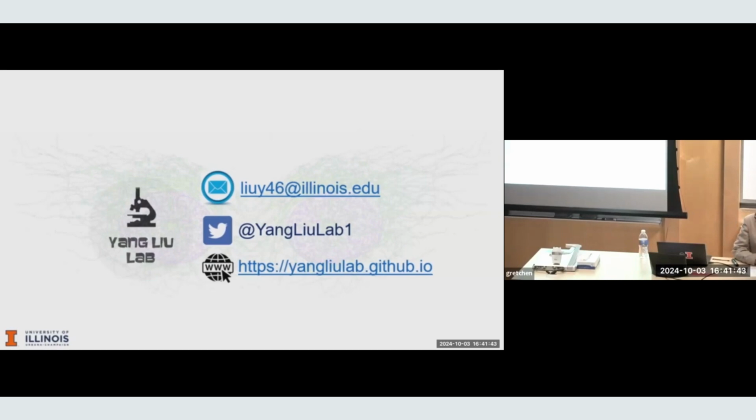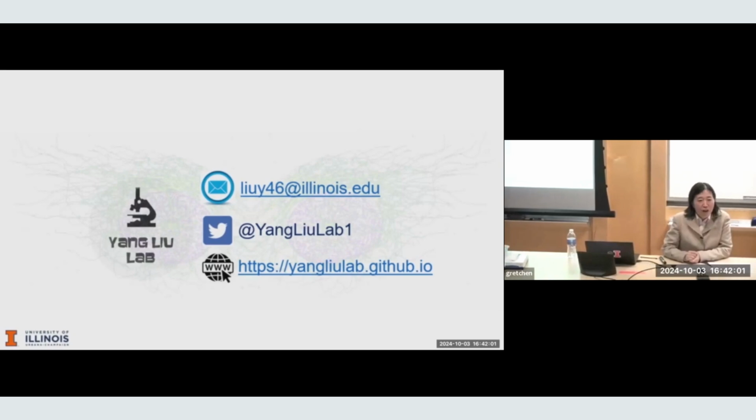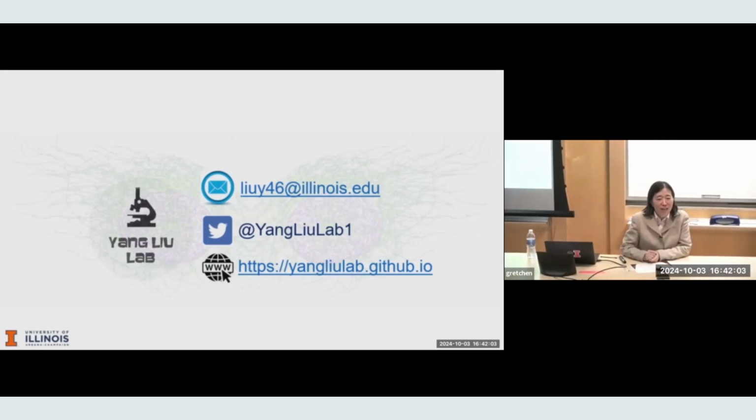I thought you were covering your windstorm thing. If I remember the steps correctly for that, you did a deconvolution of your image by removing the background, then taking the Fourier transform, and then performing a linear deconvolution before doing the inverse Fourier transform. Right. And it seemed like from what you said, you were doing these Fourier and inverse Fourier transforms in order to cause this linear deconvolution to not be as noisy.